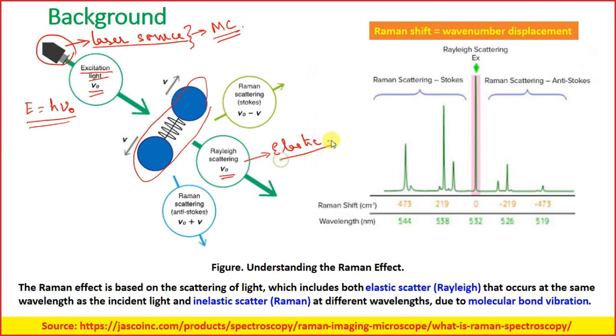In elastic scattering, there is no loss of energy. This scattering is regarded as Rayleigh scattering.